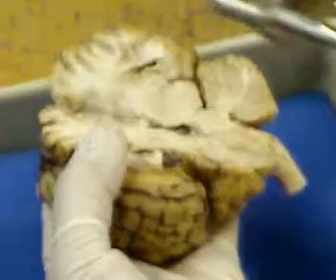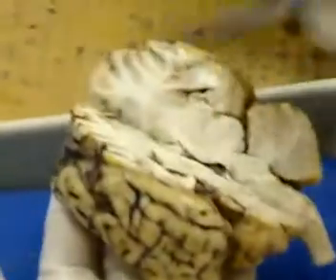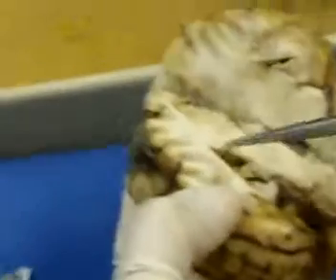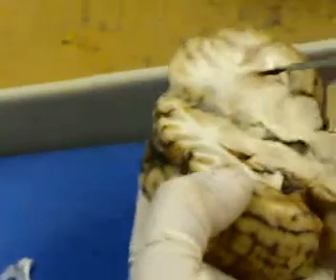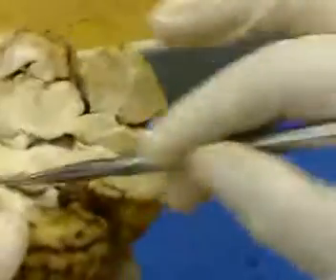Okay. Next one is lateral ventricles. Now these are two cerebral hemispheres, right? And this is the lateral ventricle, which I'm opening up now. Can you see this opening? On both the sides, this is the lateral ventricle. These openings, can you see? See, they are on the lateral side, both of them.